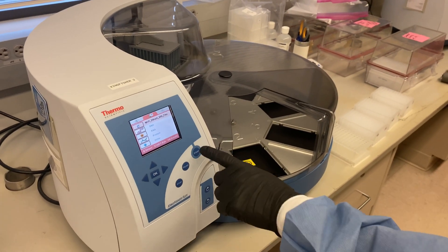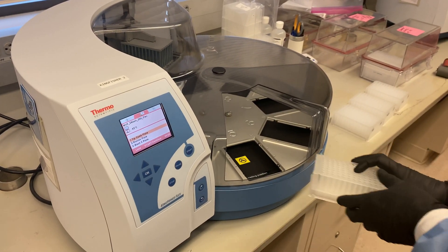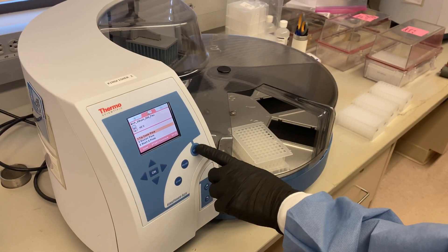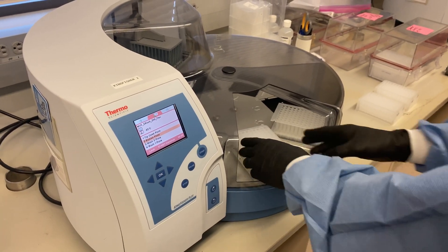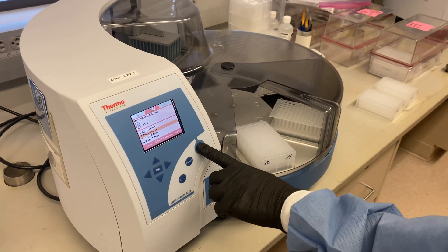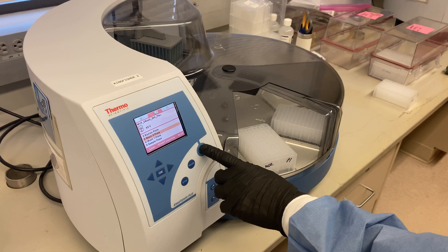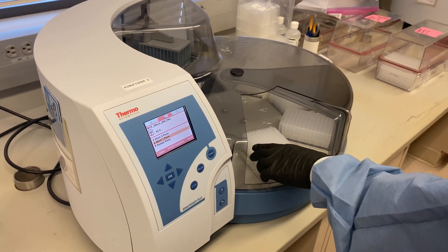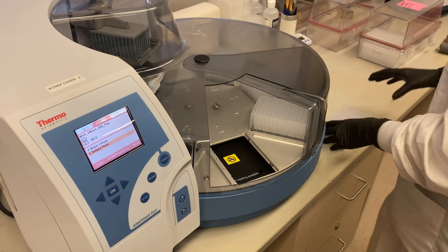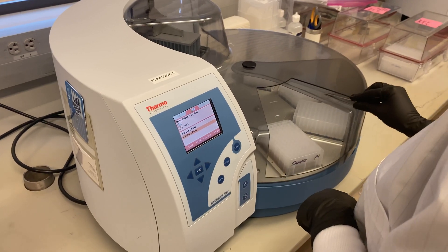When everything has been pipetted, the KingFisher Flex is ready to be loaded. Once the previously installed extraction protocol is selected, the display screen tells the user which reagent plate goes in which position. Finally, the sample plate is loaded and the program is started. The extraction process takes approximately 24 minutes.